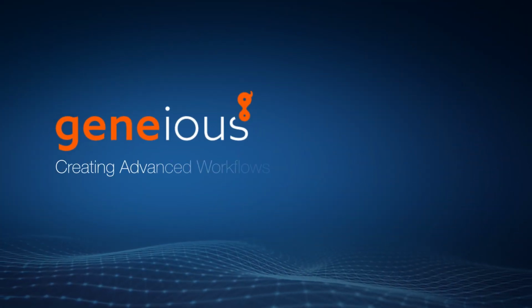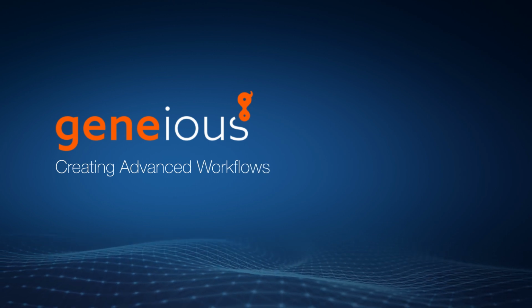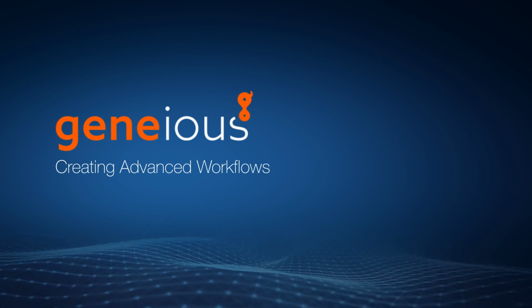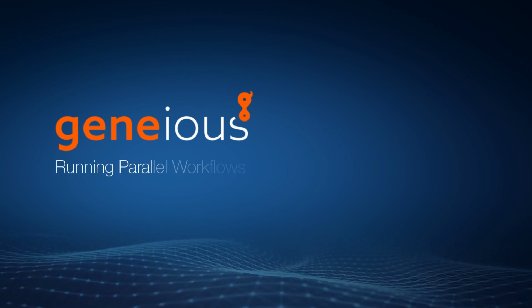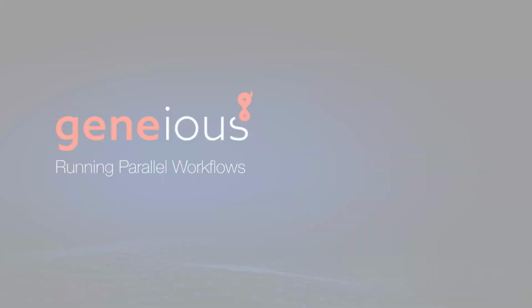Welcome to this video on creating advanced workflows with Geneious Prime. For an introduction to automated workflows, watch our previous video. Let's start by running parallel workflows.